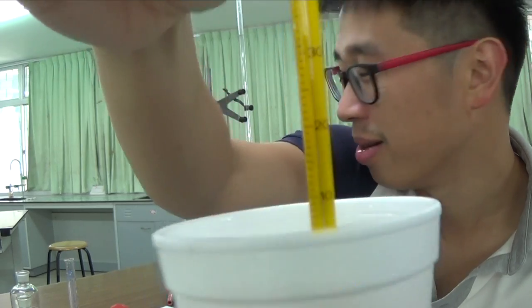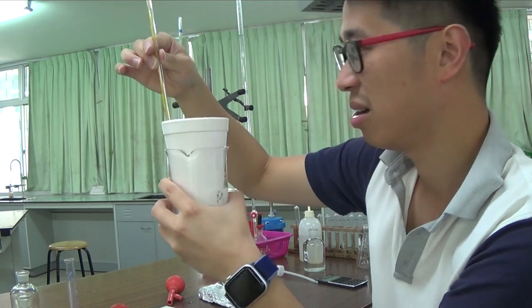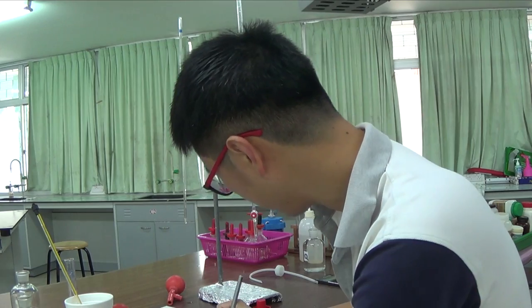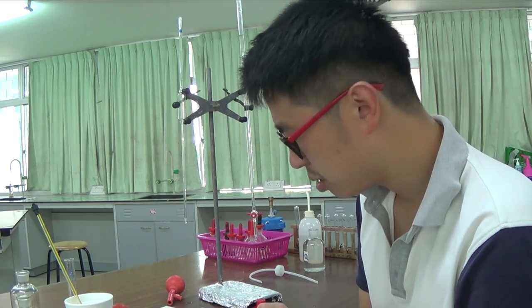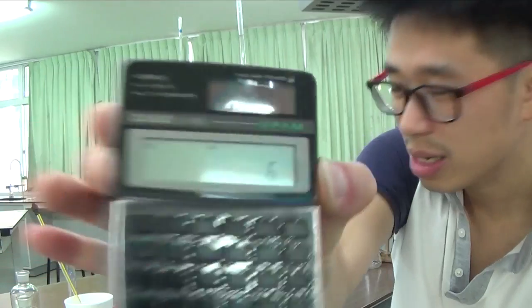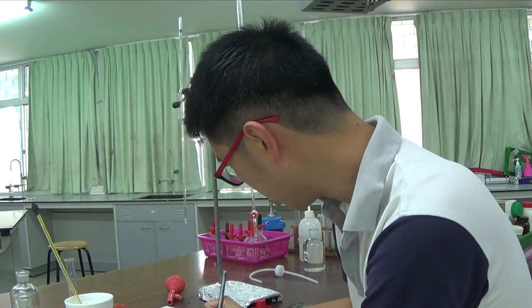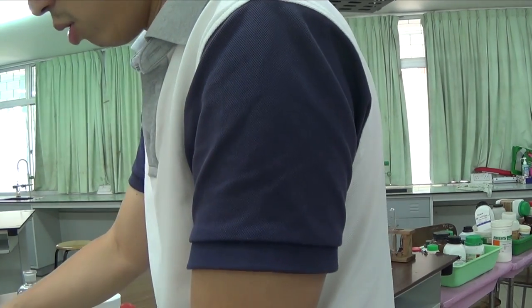Not very clear at all, okay? Anyway, you just have to take my word for it. It is 28.5, that's the highest, 28.5 Celsius, okay? And it seems to have settled on that. So 28.5 was the highest, minus 22.5. My calculator shows me 6, just like your calculator will show you 6. Again, this is the temperature rise, this is what you calculated. Instead of writing it down as 6, you really must write it down as 6.0, okay, to be consistent with the data. Alright, so I will quickly wash my thermometer.